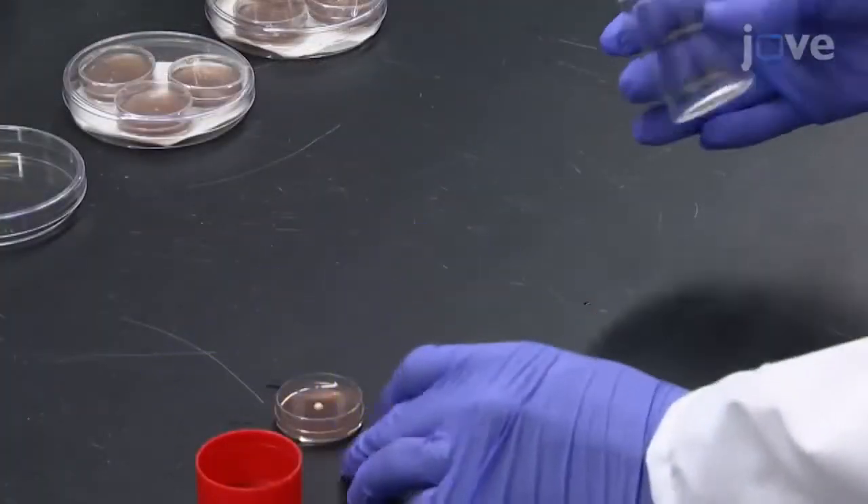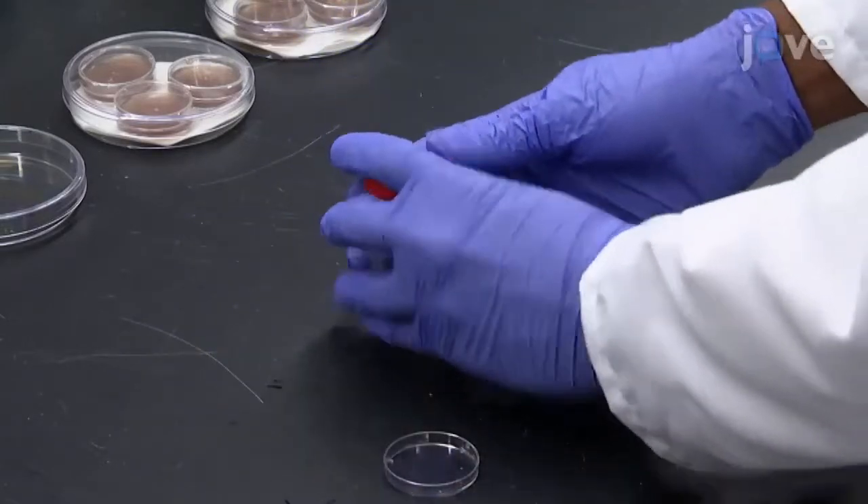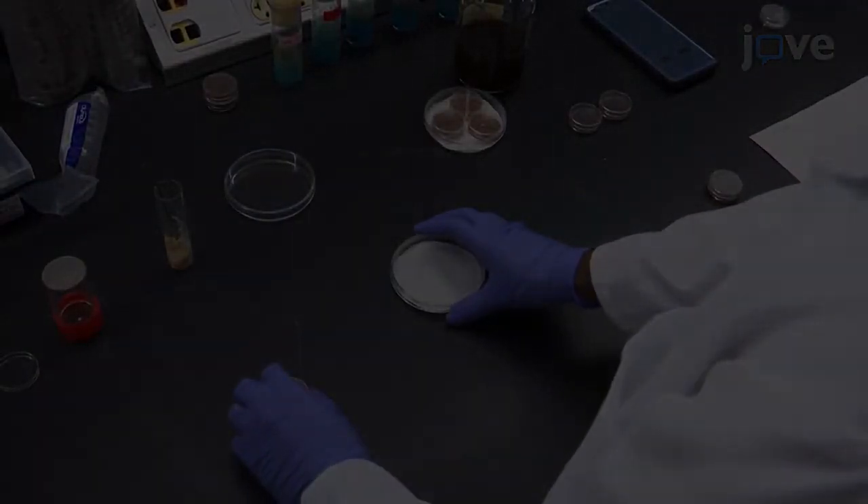If several days of laying are to be scored, place a new agar plate into the collection cage. Use the microscope to determine the number of hatched embryos and L1 larvae.